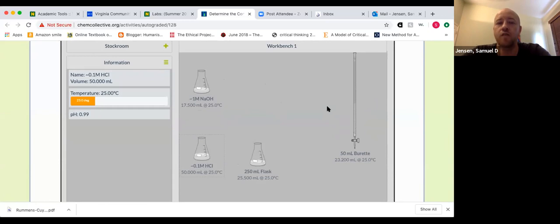And so this is a full lab write-up, just like normal. Title, purpose, procedure, your data section with the pre-lab questions, and a conclusion. The purpose of the experiment is to determine the concentration of an HCl sample. We are doing this via titrations. The concentration of your sample is what?